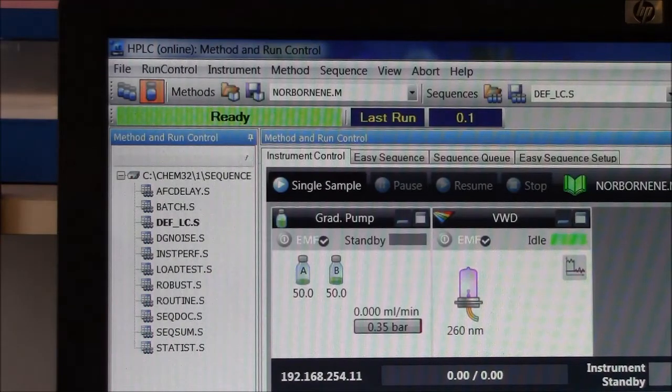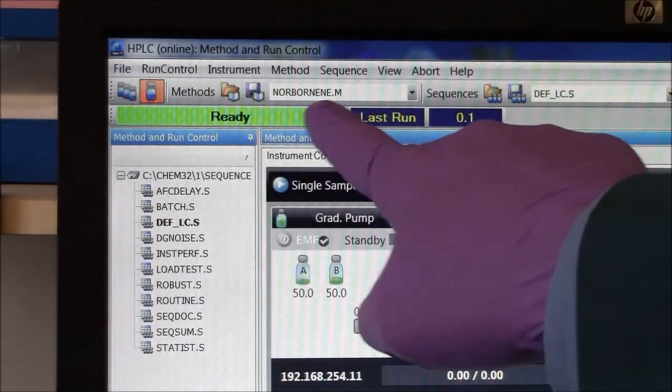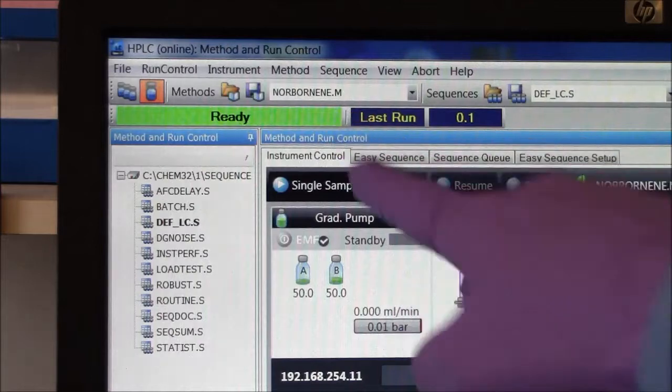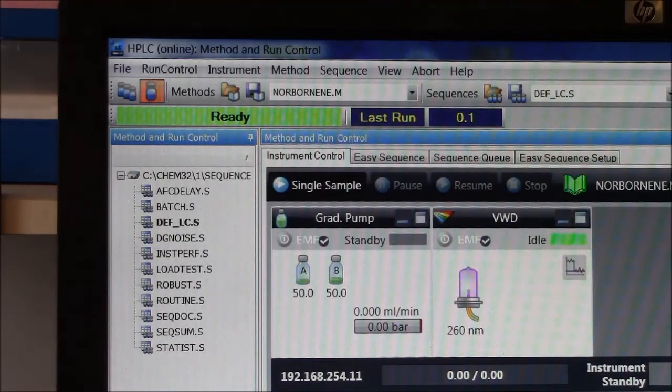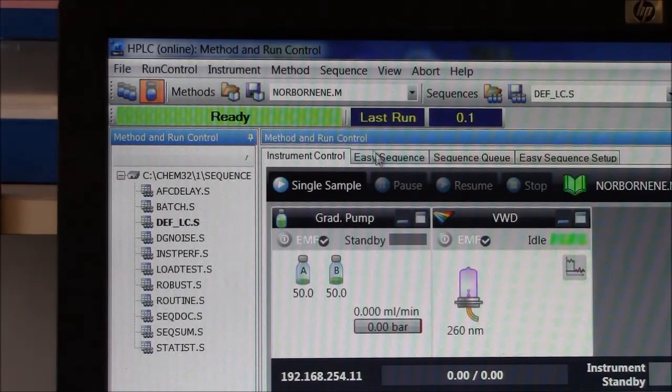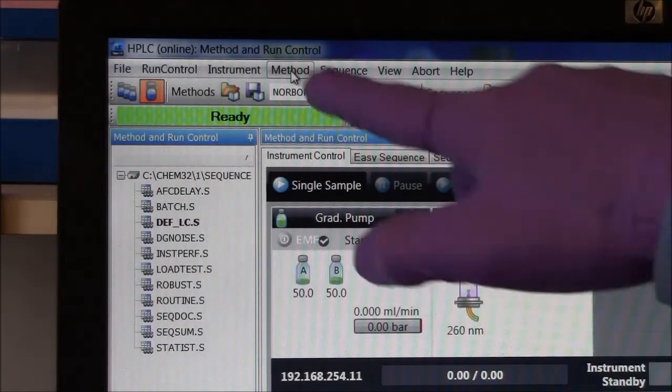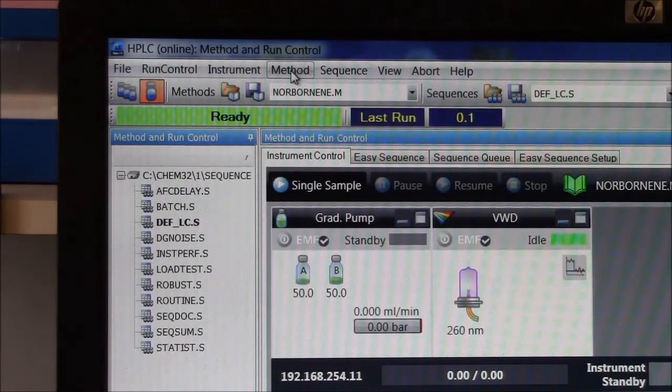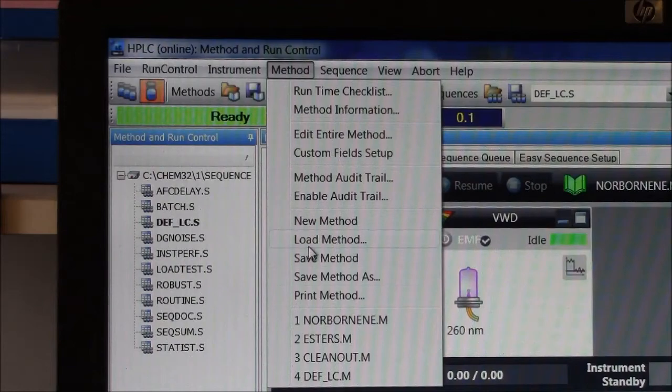We're doing analysis of esters, so up here is the name of the method that the machine is using. Right now it says Norburnene. We want that to be esters, so here I'm clicking on method and I will load method.